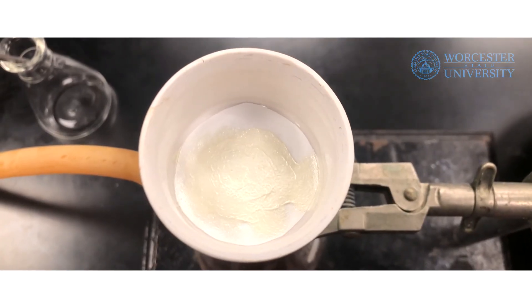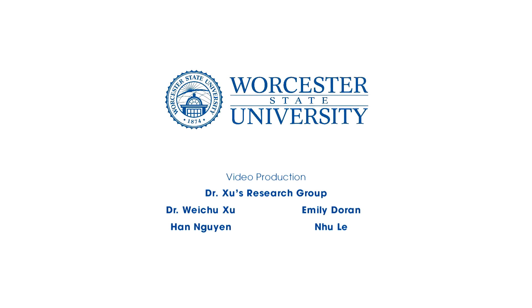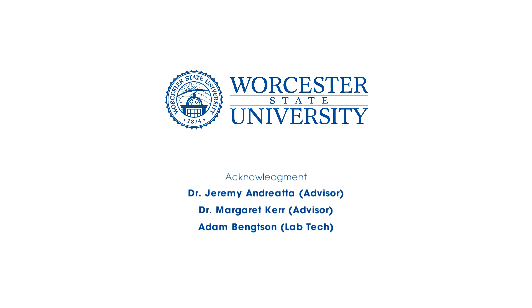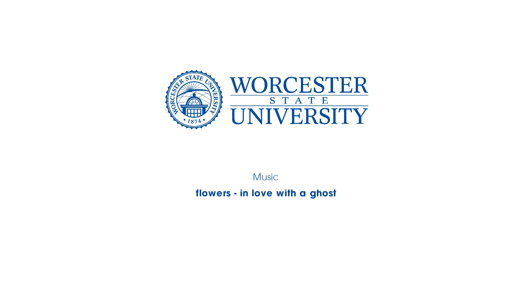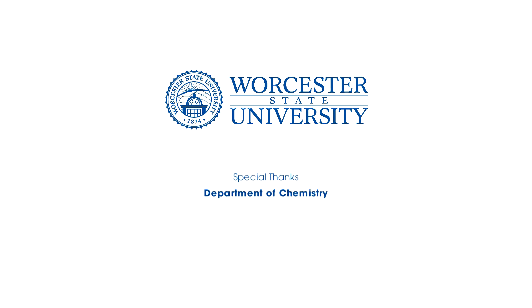Identify your product using melting point and IR spectroscopy. And that's it! I hope this video helped with your understanding of the aldol reaction.